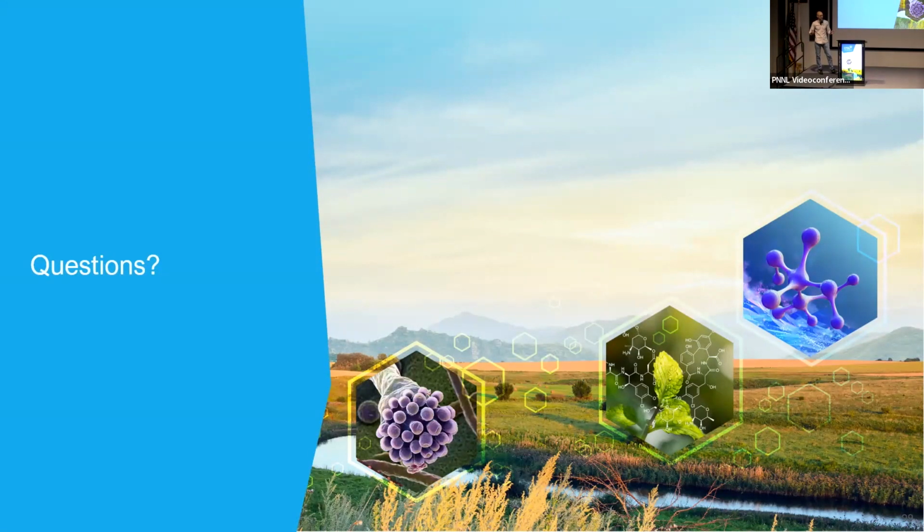So FTICRs are not great instruments for that. But we can definitely add not only bromine, which facilitates molecular annotation because of those isotopic patterns. We can introduce any other halogenated compounds that have stable isotopes that are very easy to spot. So yes, that's very feasible to do.